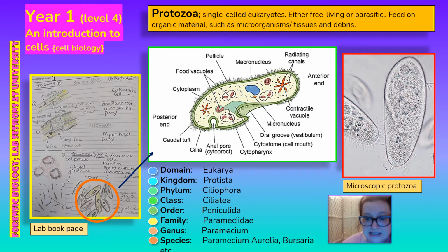And you can see there's little cilia. Cilia is very similar to what you have in the bowel, where the cilia help move the food down the lining, and it's actually absorbed into the bloodstream. So yeah, okay.